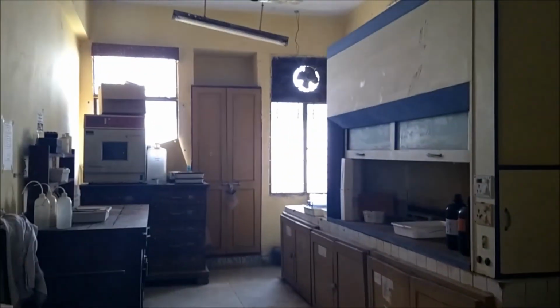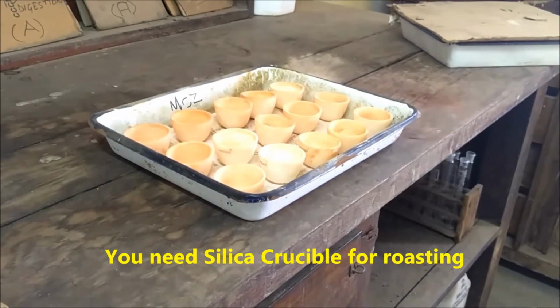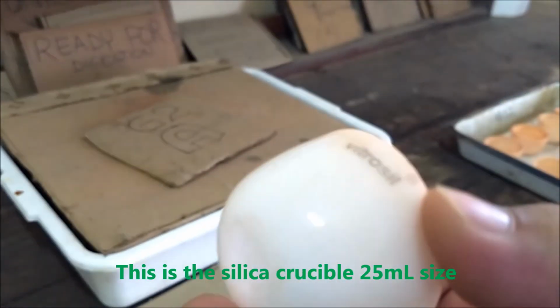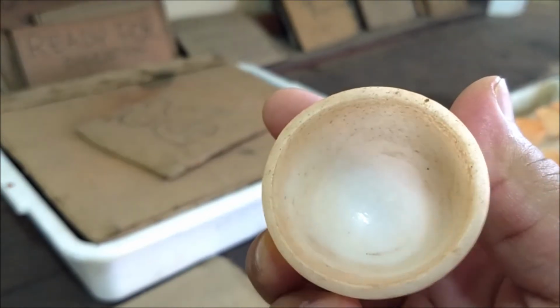1. Roasting. Gold exists in nature mainly in the form of pyrites. Therefore, it is necessary to remove the sulfides, hence roasting is performed. This is a 25 ml size silica crucible which is going to be used for roasting.